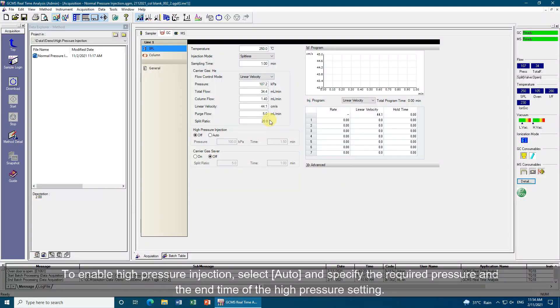To enable high-pressure injection, select 'Auto' and specify the required pressure and the end time of the high-pressure setting.